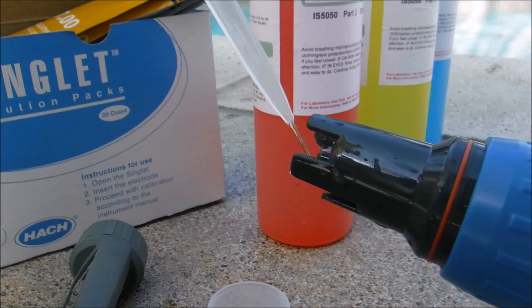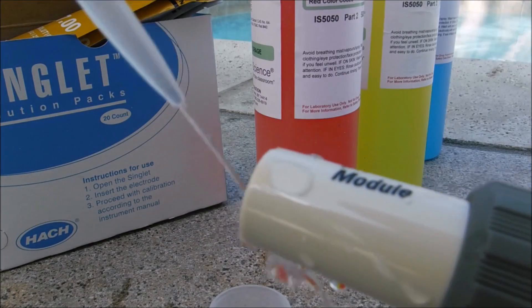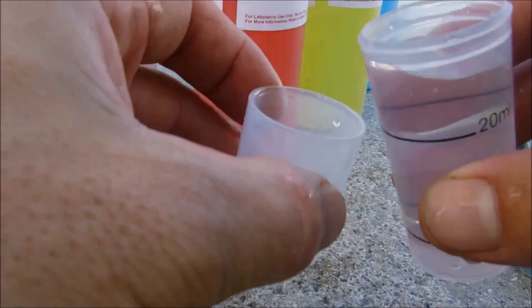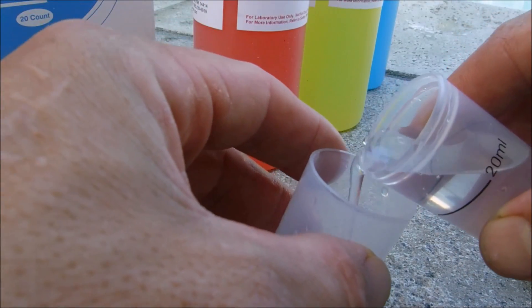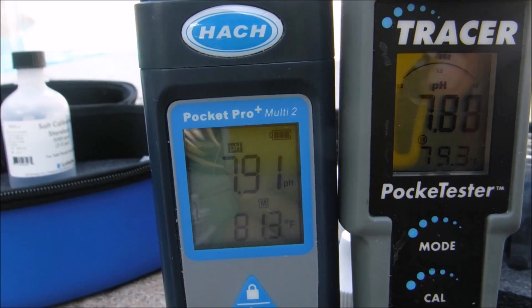I'm going to go ahead and get the pH in this pool. I'll rinse off the sensor with some deionized water, and rinse off the Tracer sensor as well. I'm using the same water sample for both testers, and the pH on the Hawk tester is matching the pH on the Tracer — pretty much equal.